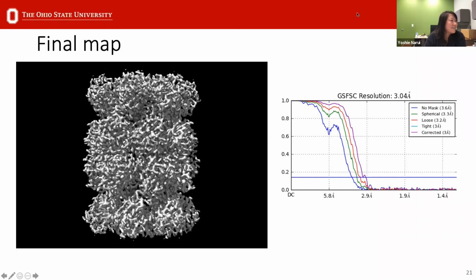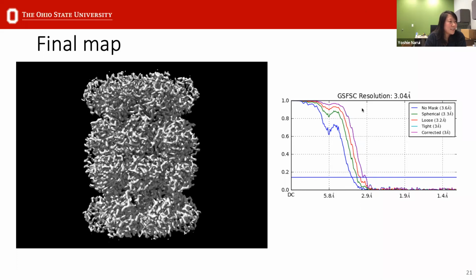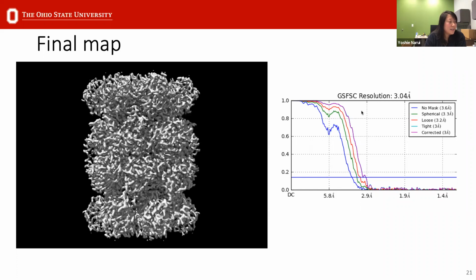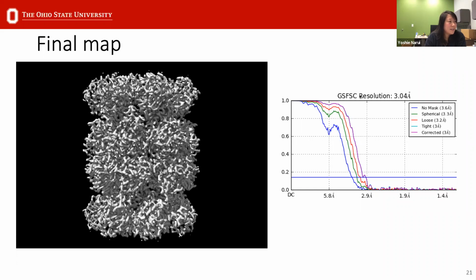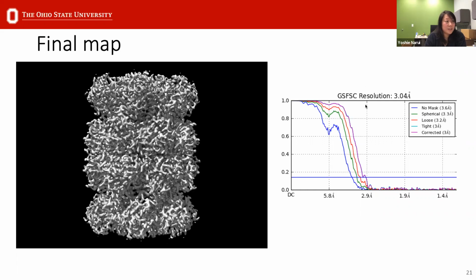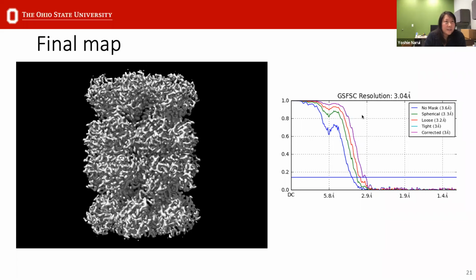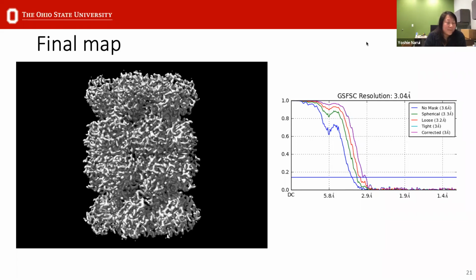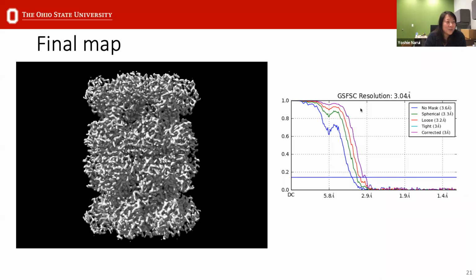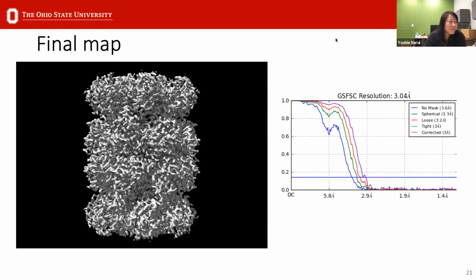Any more? I would say Relion also has a very good tutorial as well. I'm only showing the CryoSPARC one, but you can try both. I think they use Beta Gal in their most recent tutorial, but try them both.